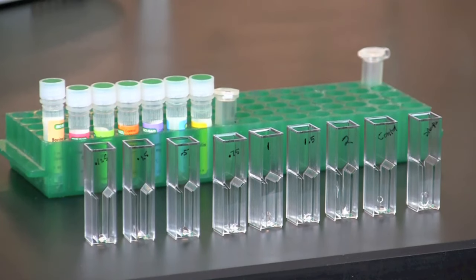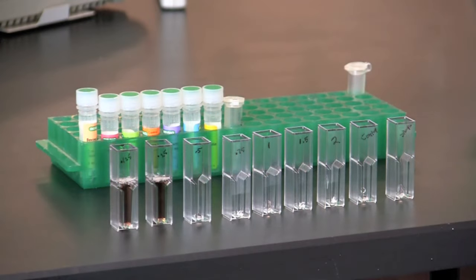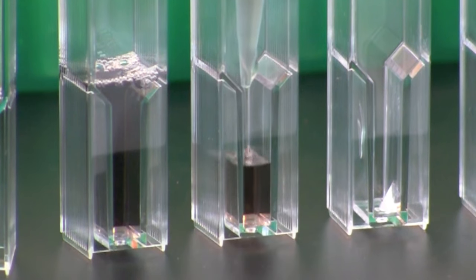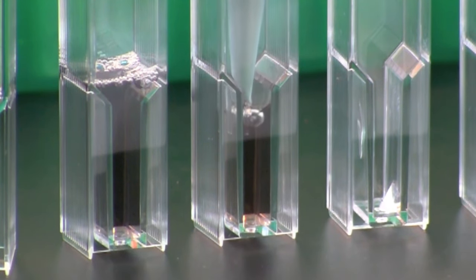Now you are ready to add the Bradford reagent to all of the cuvettes you have prepared, including the sample and control. Add 1 milliliter of 1x Bradford reagent to each of the cuvettes. Mix completely by pipetting up and down with the micropipet.